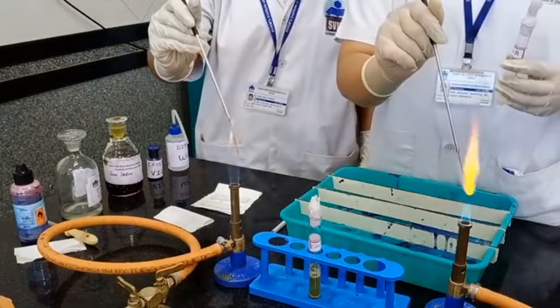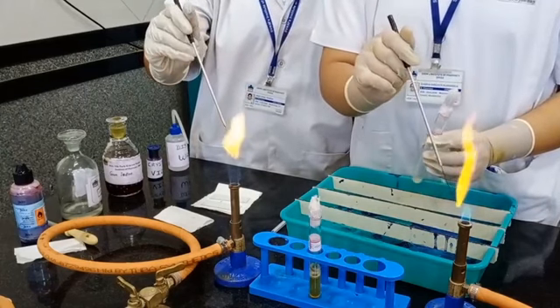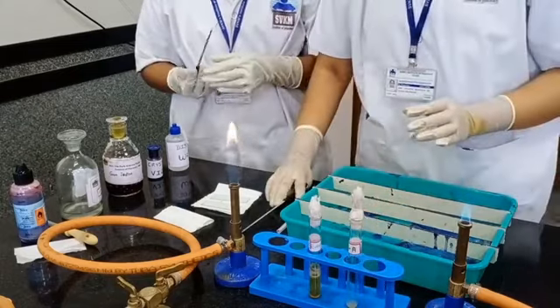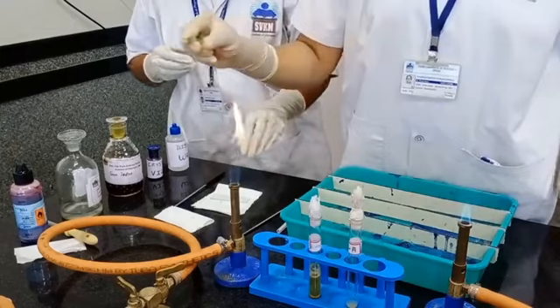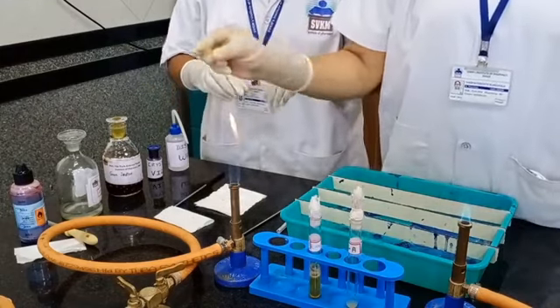We have to spread the smear on the slide. Sterilize the loop again. Now heat fix the slide smear by rotating the slide over the flame.